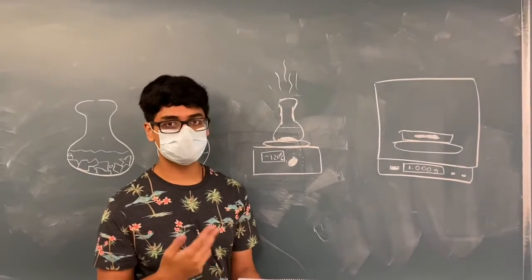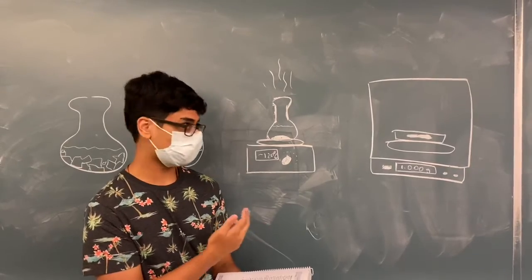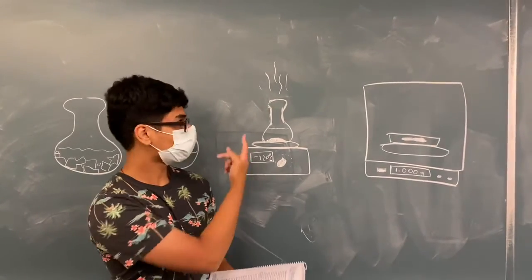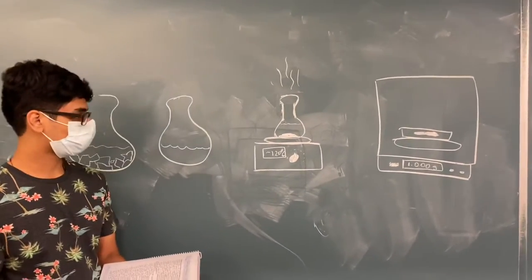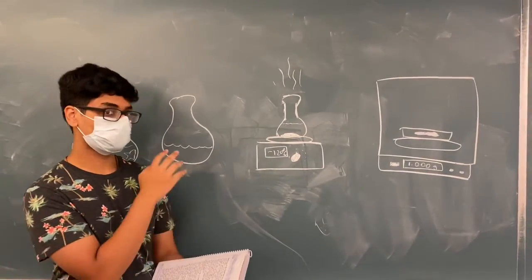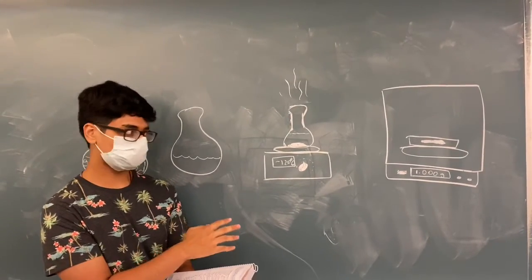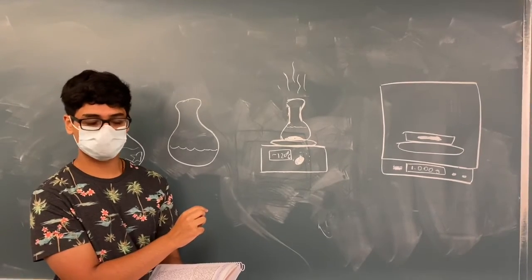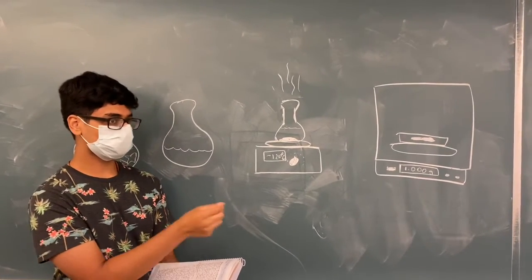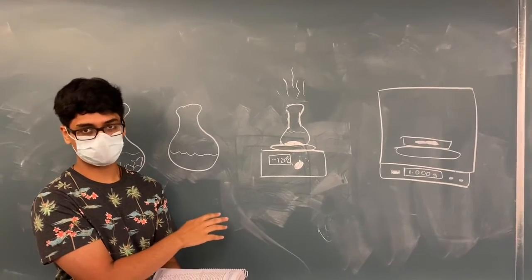You want the water to be boiling, a hot solvent, so it can help dissolve the acetanilide. You'll most likely observe some water vapors forming on the top. Then, after you notice that the entire acetanilide sample has been sufficiently dissolved, it should be a clear solution, no particulates found along the sides. After that is observed, you take it off the hot plate and allow it to cool to room temperature.